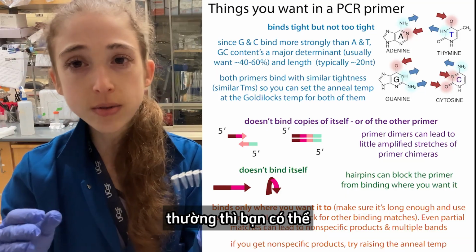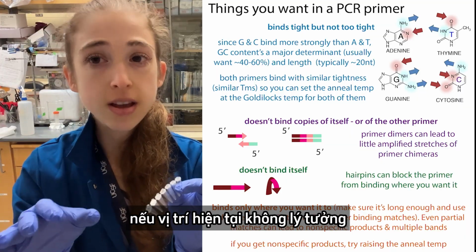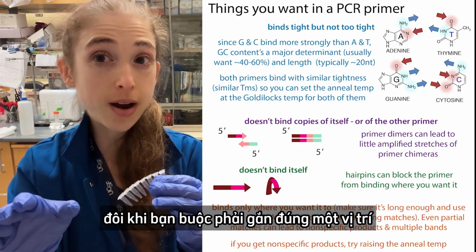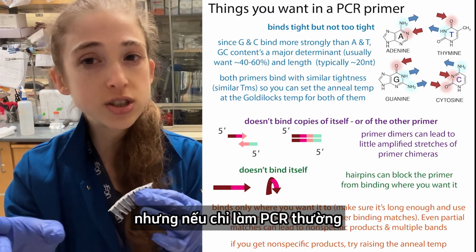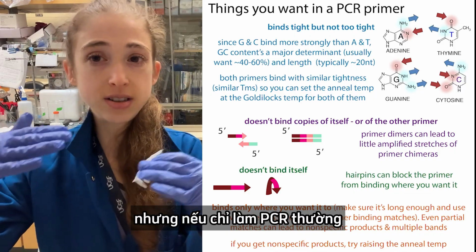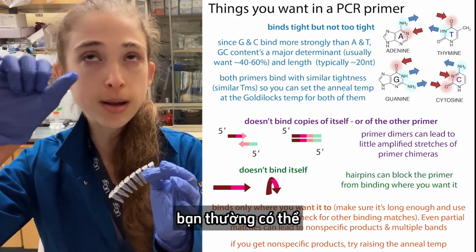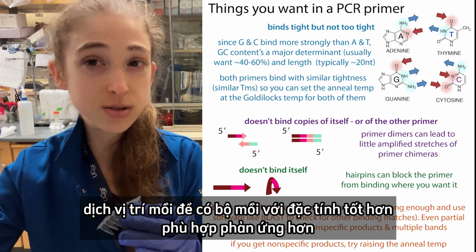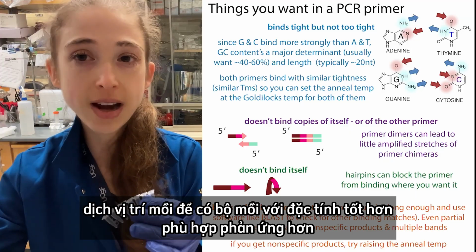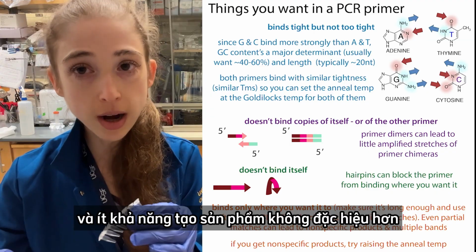And often what you can do is change the site of where your primer is binding if it's not ideal. Sometimes you have to bind at a specific site if you're doing some sort of mutagenesis, but if you're just doing a PCR, like for qPCR, you can typically adjust where your primer is binding in order to have a primer with characteristics that are better for your reaction, such as a higher TM and less likelihood of forming those non-specific products.